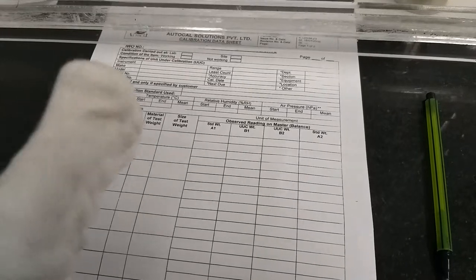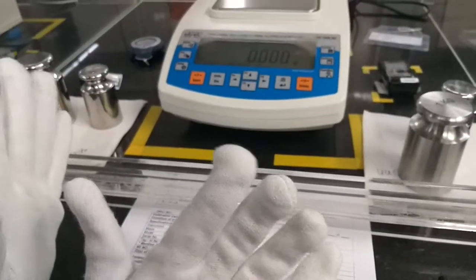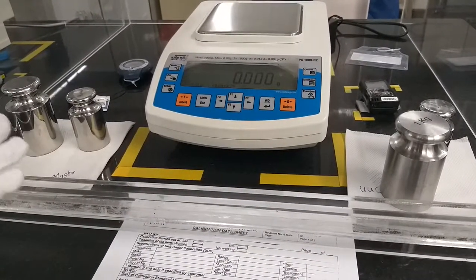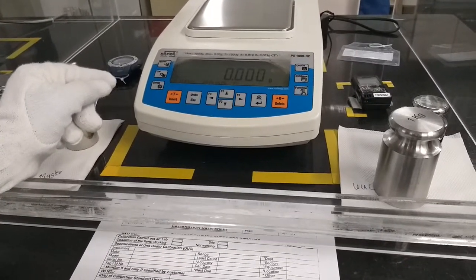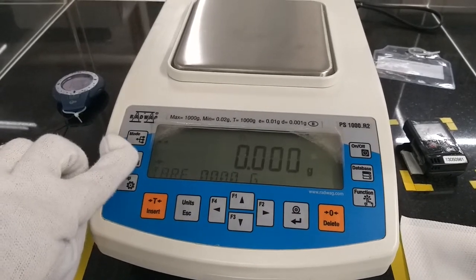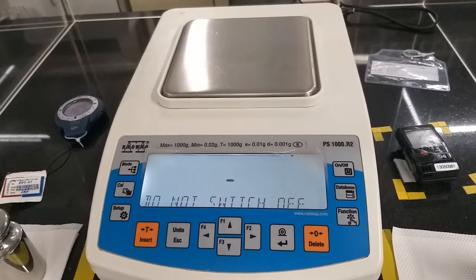Before starting calibration properly, an important note: wearing hand gloves is very important. Without wearing hand gloves, we cannot touch the weights. Before starting calibration, the balance should be calibrated — we press the CAL button so that all errors from the balance are removed.